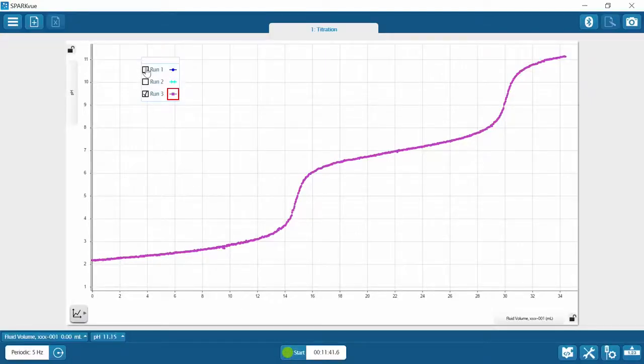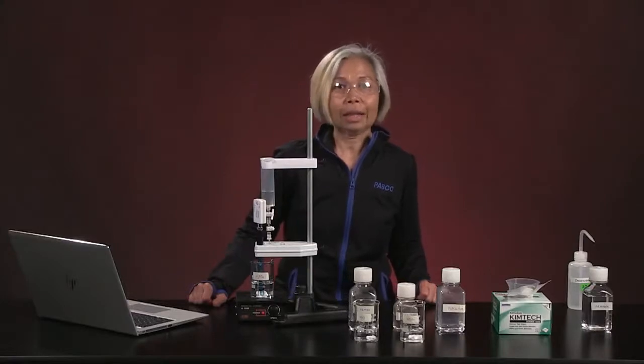Let's pull up all of our three curves. That's hydrochloric acid, that is acetic acid, and this is phosphoric acid. Now we are ready to do our analysis.